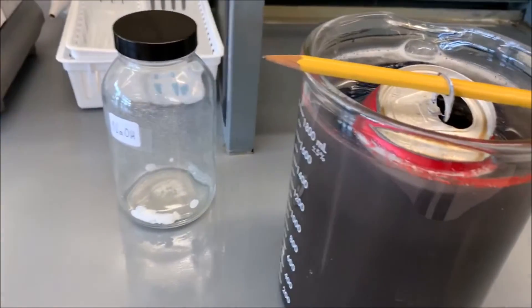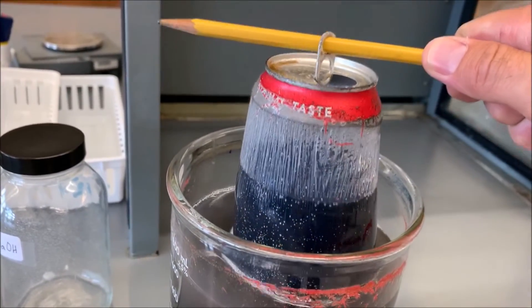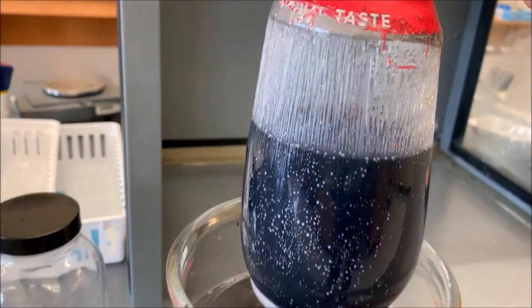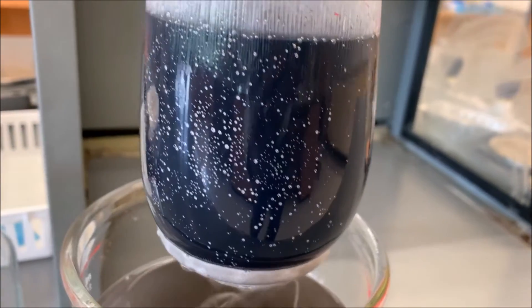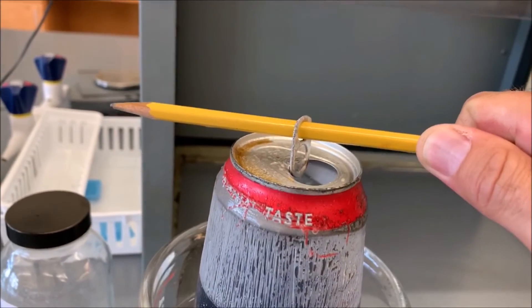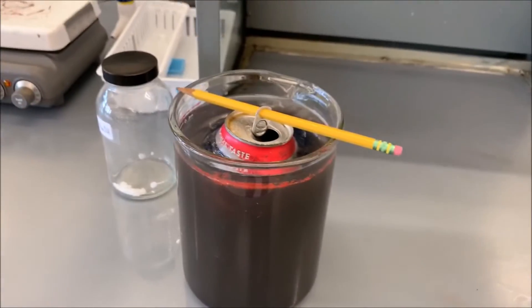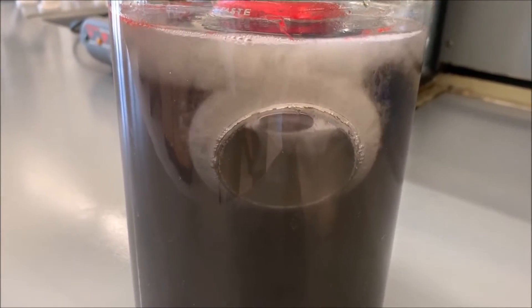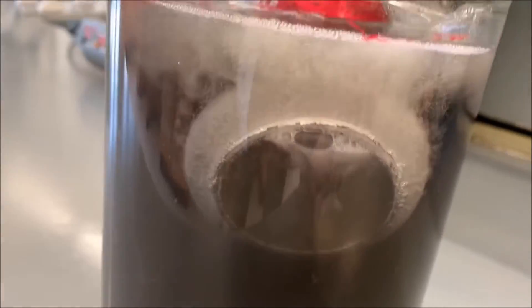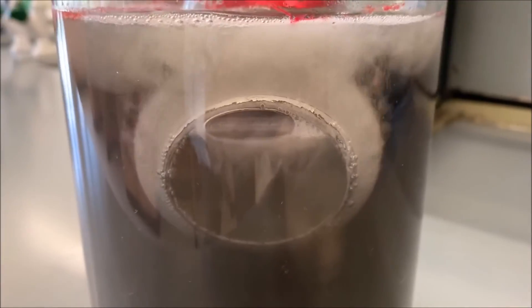I'm going to pull up the can slowly. Check it out — that is crazy. The top's still reacting a little bit. That is just insane. Interestingly, the bottom always takes longer to react, and that's because those bubbles of hydrogen gas get trapped, and that slows down the overall rate of the reaction in that particular region where it's concave like that.